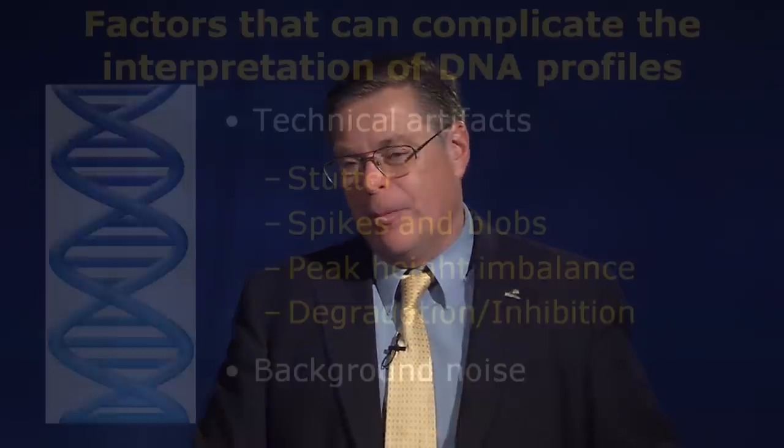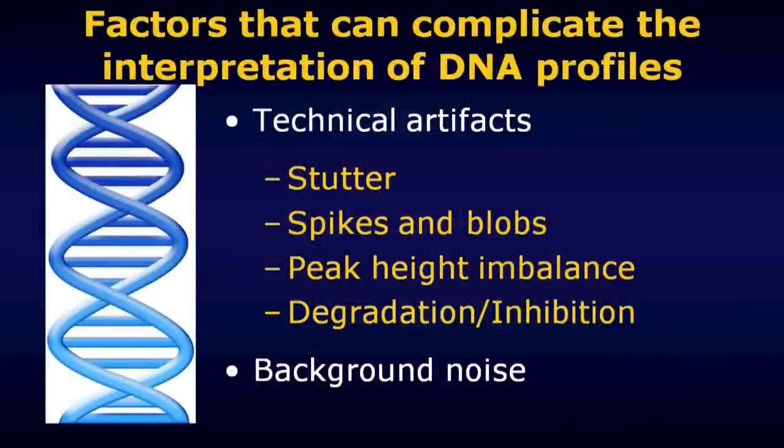So where have we been during the course of this video? Well, again, this video was all about talking about factors that can make interpreting DNA profile evidence, electropherograms, a little bit more complicated than you might have thought if you had only cut your teeth looking at reference samples. These are the sorts of things that come up time and again when we're talking about issues that make interpreting evidence samples a little bit more complicated.